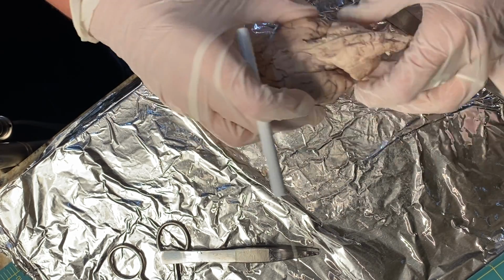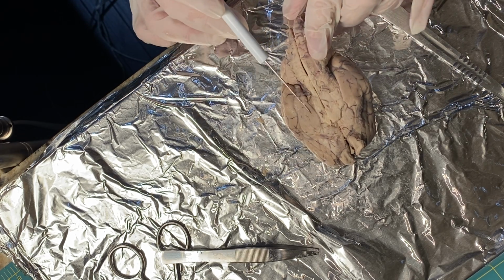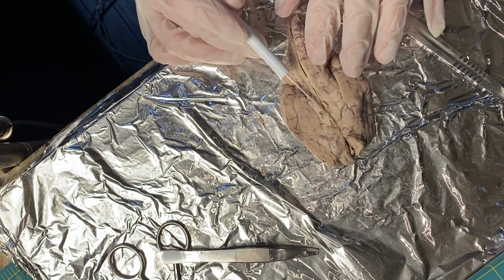And then we have, I believe this is the optic tract as well.